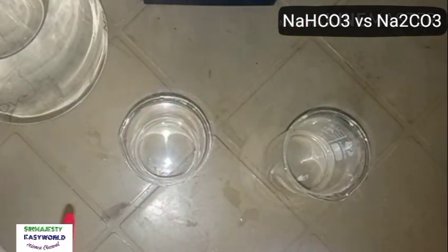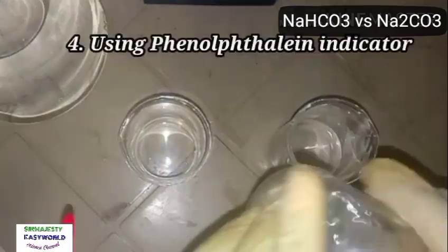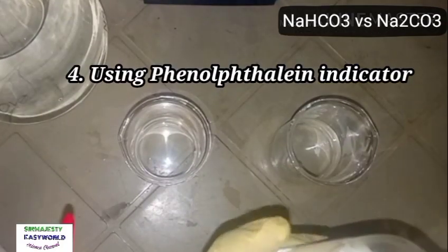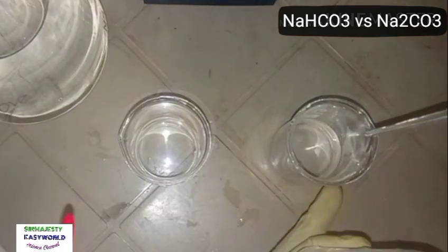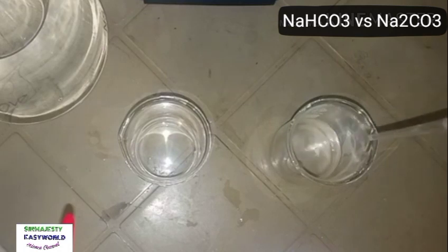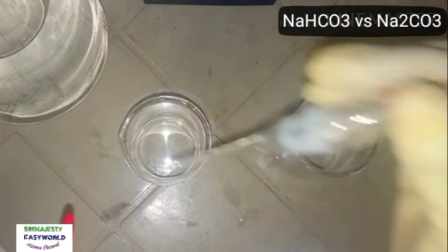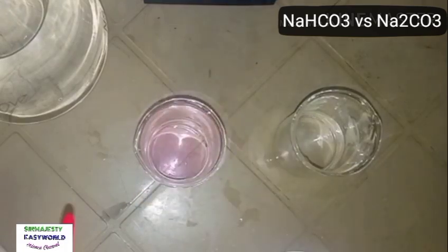Then, another thing is that I want to use phenolphthalein on the two. We all know that the color of phenolphthalein in base is pink. So this is phenolphthalein. This one will distinguish it faster for you, at least at the beginning. If you drop phenolphthalein, this is the bicarbonate. You see I've dropped phenolphthalein. There is no color change. I'll shake well. There is no pink coloring. But if I drop it here, you see already. So phenolphthalein will help you distinguish it faster.